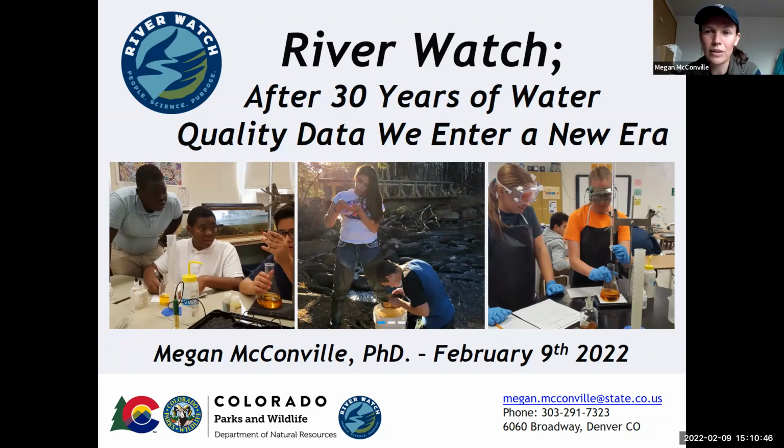In April, we're destined to get a new instrument, an ICP-MS spec. And we hope that at that point, we'll be able to actually show you the lab and the working environment, which right now is being remodeled to have capacity for that new instrument.